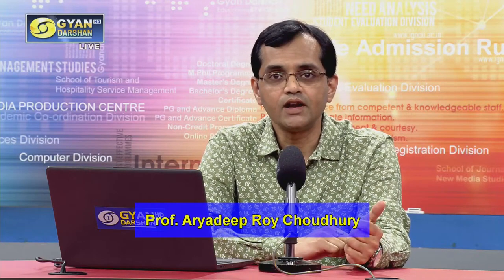Now, if you remember, in my last session, I started discussion on the MSc Zoology program Laboratory Course 1, which is the practical course in your MSc Zoology program. In my last discussion, I took up 3 experiments: one on plasmid isolation, one on agarose gel electrophoresis, and also the quantification of the nucleic acids. So these 3 experiments were dealt in my last discussion.